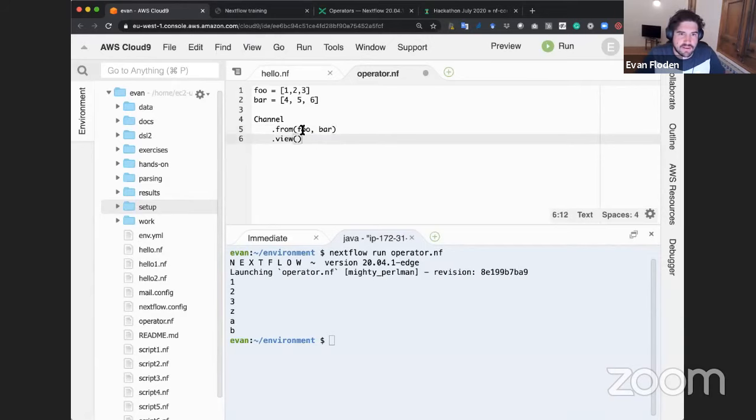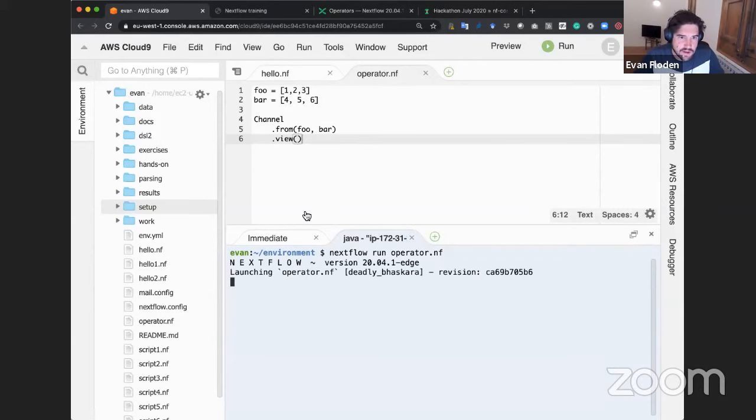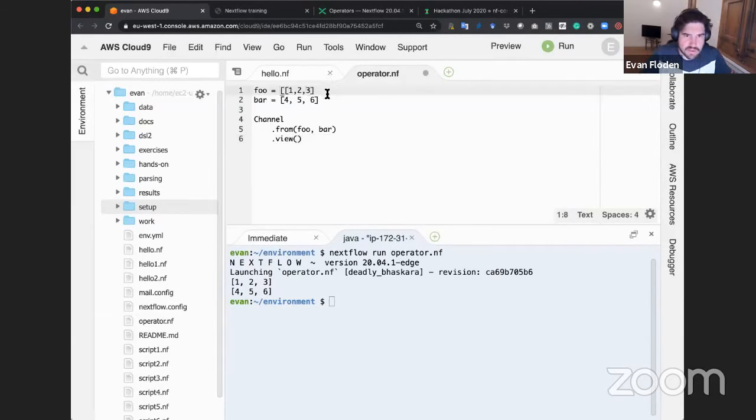Imagine that I had this channel. Let's have a look at what it looks like. If we run this, we've created this channel and it contains 2 elements. One of them is 1, 2, and 3. One of them is 4, 5, and 6. Imagine that we had a more complex channel, something like this.